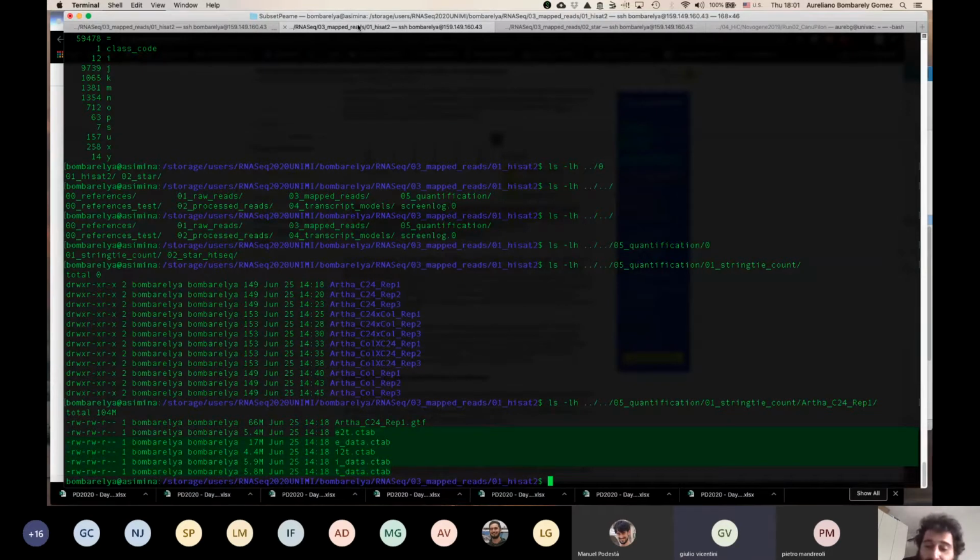No. And that is a good question, because when you are cleaning the files you have to take some decisions. You have pairs. The thing that happens with FastQ-MCF is if this pair fails, you also remove this one. It doesn't care about anything, I remove this one too. The thing with Trimmomatic is that if this fails, it still keeps this one, but in a separate file. So you will have pair 1, pair 2, and then the 2 unpaired files that they still may have.